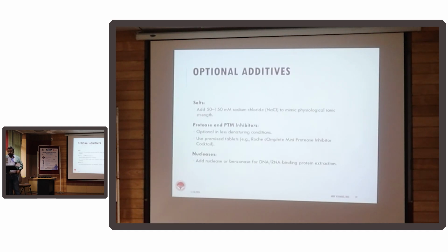Also, you can use some additives. If you want to work on a cell system, you don't want the cells to burst immediately, so you can use salts to mimic the physiological ionic strength. Always use protease and PTM inhibitors, right?